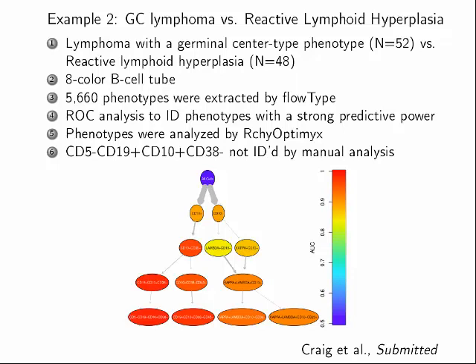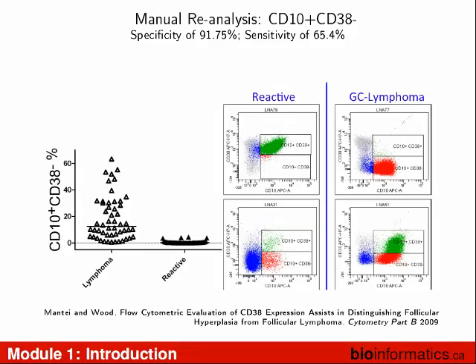So we get this. This is what we spit out. These immunophenotypes hadn't been found by manual analysis. She goes back, does some gating, can find that by hand, so it's actually there, and then looks at the difference between group one and group two. It's like, yeah, your stats actually make sense. So, ding, another paper. That's the paper.